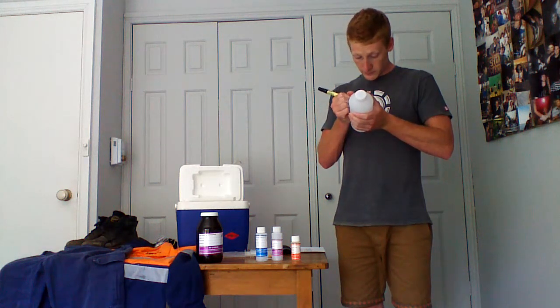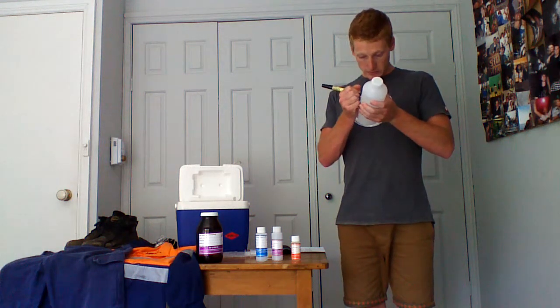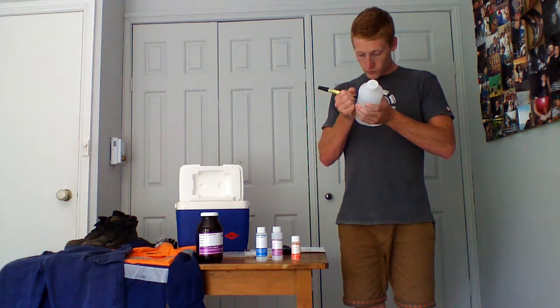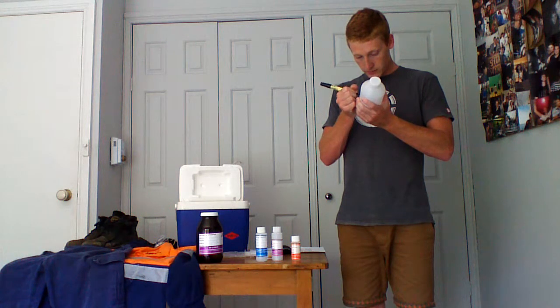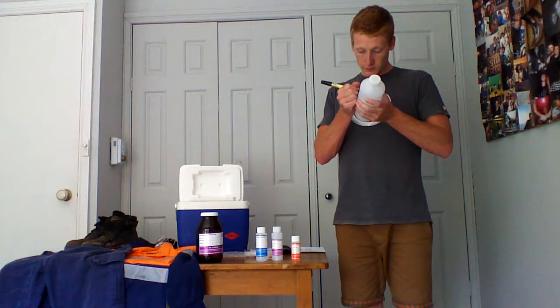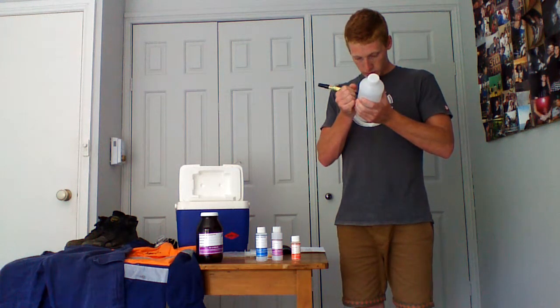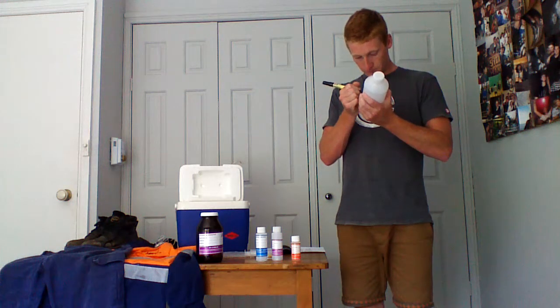So client and reference, SCIT2100, that's who we're sampling for. Sampled by, put my initials, AB, Angus Brown. Sample ID, we'll have license discharge point 1 at site X, and date and time, we'll have 10 o'clock on 21st of the 10th, 13.